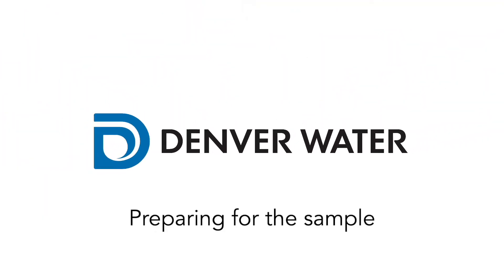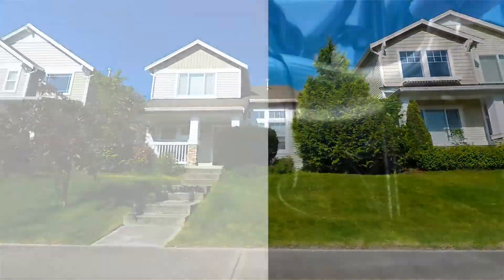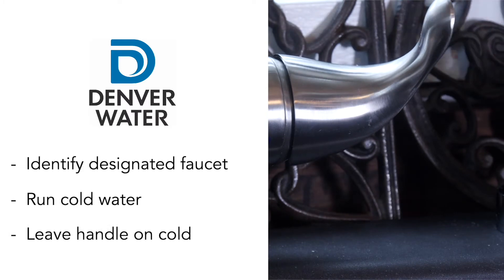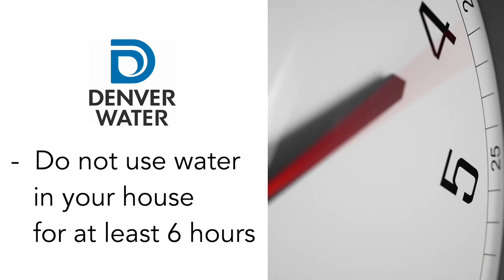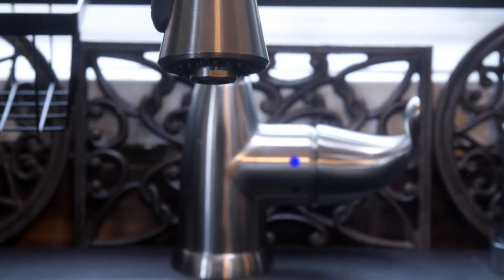Before you begin sampling, first confirm your house was built between 1983 and 1987. Next, identify the designated faucet where you will be collecting the sample and run some cold water through it. Then turn the water off and leave the handle on the cold setting. After this step, you must not use any water in your home for at least six hours. This stagnation period is required before collecting samples.